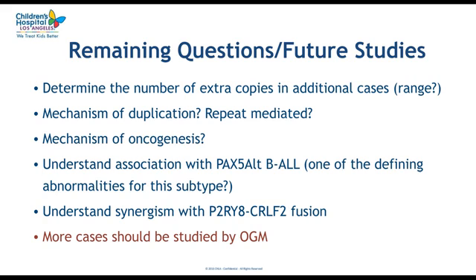So I really advocate that more cases of this abnormality should be studied by optical genome mapping or a method that allows to accurately characterize the structure of this abnormality.